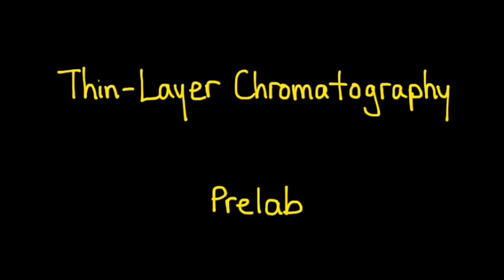This is the pre-lab for the experiment on thin layer chromatography. In organic chemistry, sometimes the most time-consuming step in any synthesis is not performing the reaction itself, but rather purifying the desired material from any unwanted byproducts. There are a variety of methods used to purify organic reactions, and one technique that is commonplace is chromatography.